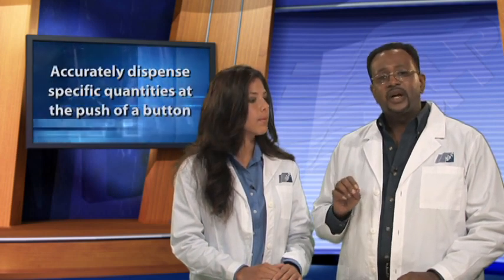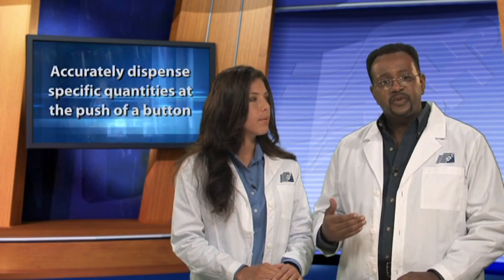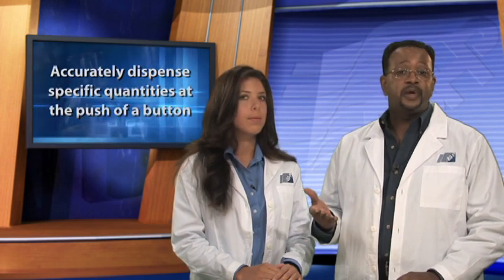It's very important to have a purified water source when compounding pharmaceuticals. Automated water dispensers are available to use a special system to filter and purify the water for safe use in the preparation of pharmaceuticals. In addition, these dispensers are designed to accurately dispense specific quantities of water at the push of a button.